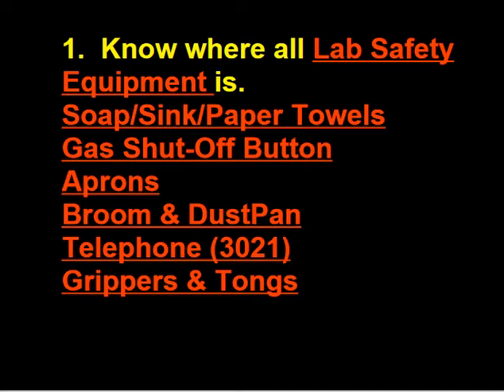So if there's an emergency and you need to call the office, please do so. The grippers and tongs we'll be using throughout the school year so you don't burn your hands with hot glassware. The goggles and the goggle cabinets. You need to wear goggles at certain times for certain labs. The fire blanket here is for emergency purposes.